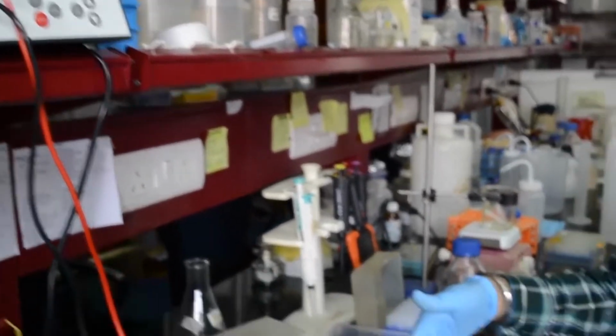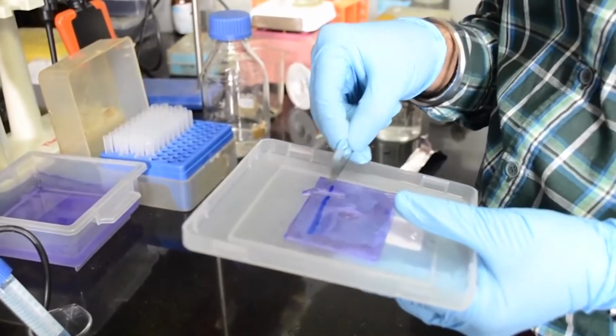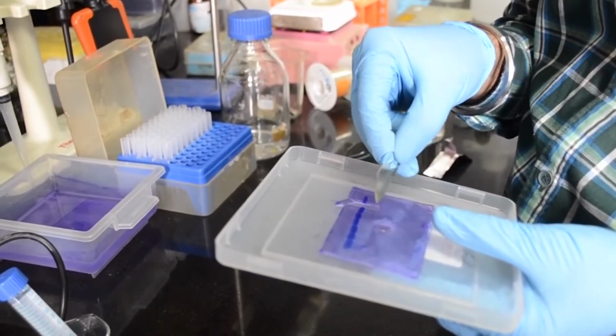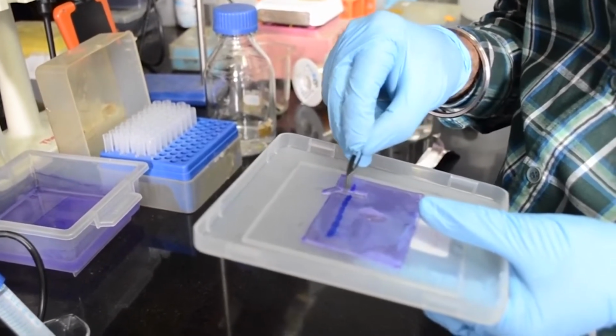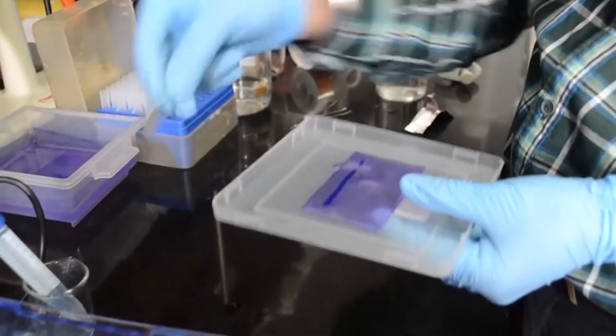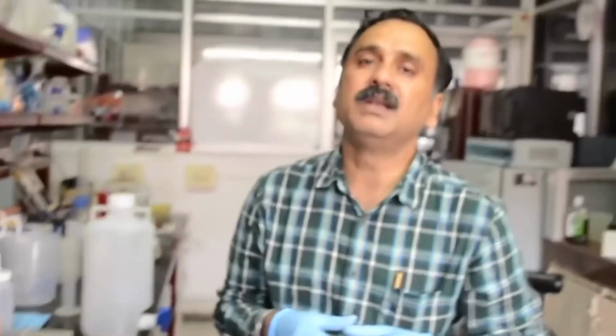What you see now is that the electrophoresis is going on. While the electrophoresis is going on, this protein band is going to start traveling into this particular SDS page. Because we have cut the SDS page at this end, the protein band will run in this direction. But after this, there is no gel. So the protein is going to fall outside the gel, and because outside we have already covered it with the dialysis membrane, it will fall into the liquid present in the dialysis membrane. Now your protein or the antigen is going to be present in that solution.